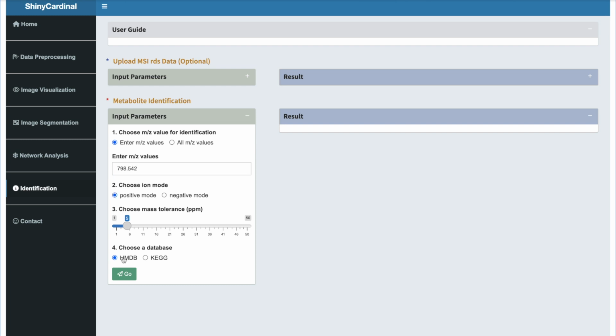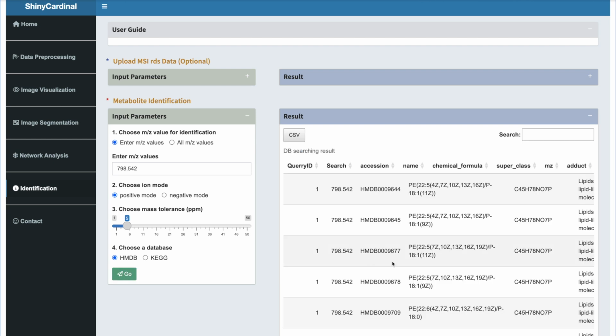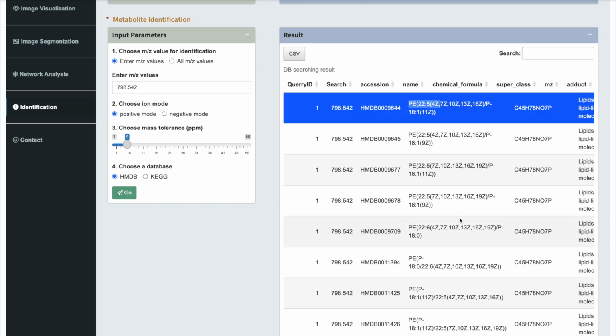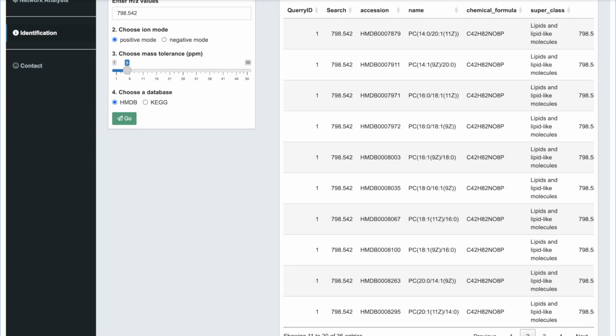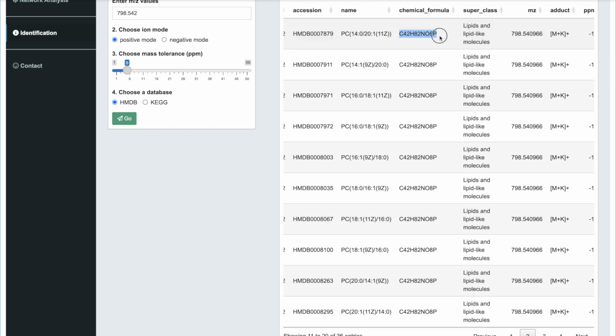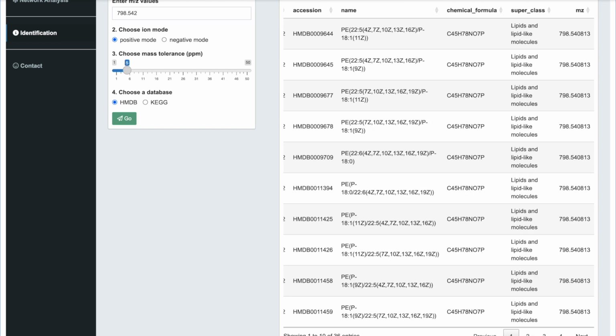And you can see, 2 types of candidates are given. One type of candidate is phosphatidylethanolamine class lipid, and another type is phosphatidylcholine class lipid. We cannot identify this mass feature only based on the elemental composition because both candidates fall in the 5 ppm mass accuracy window.